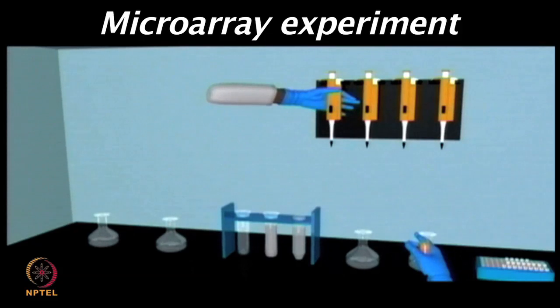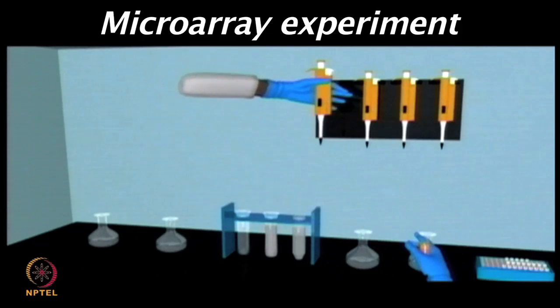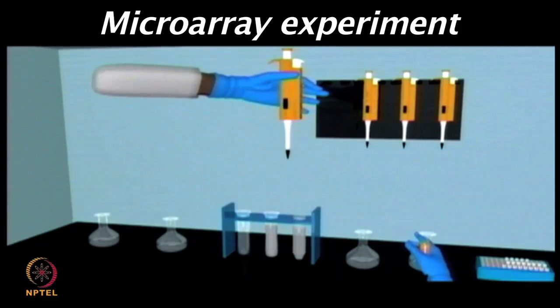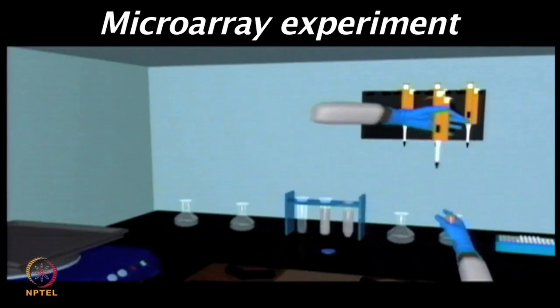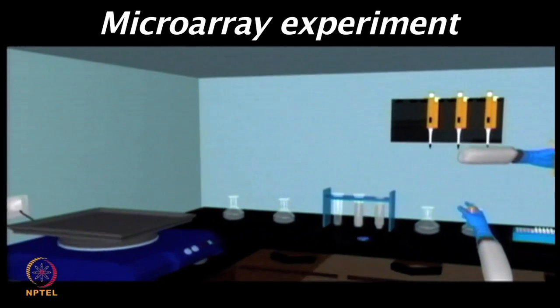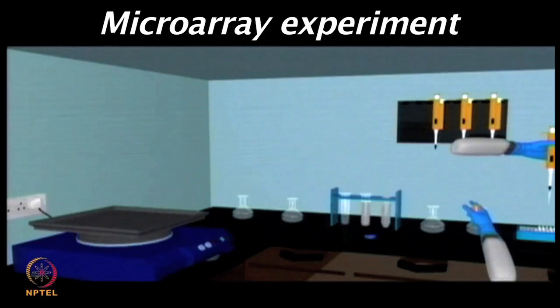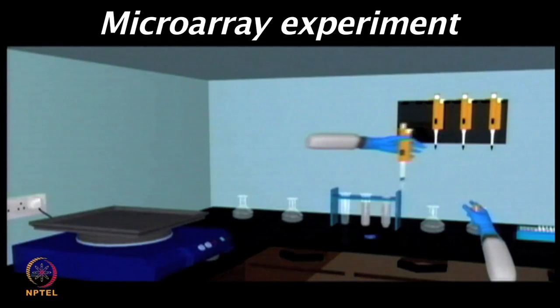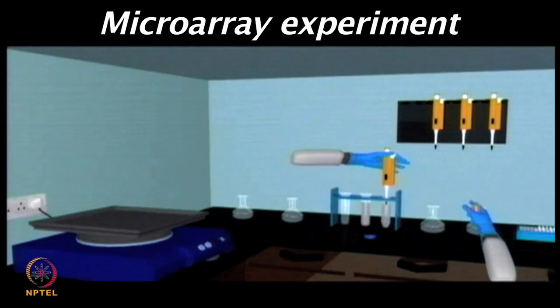After removing the chips from the -80 freezer or synthesizing the proteins by using a cell-free expression based system, first of all you would like to block those areas which do not have the spot features. So, to avoid non-specific binding, first of all one needs to add a blocking solution.